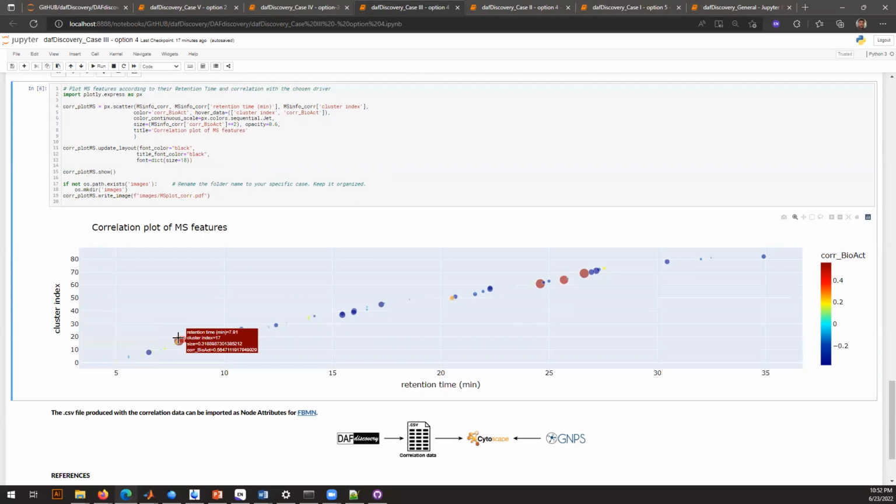In this case, this is not MS/MS, so you don't have selection for the ionized species. This is done, just to remind you, all the MS data is done after the deconvolution, right? The right processing, as you would do with MZmine 3.